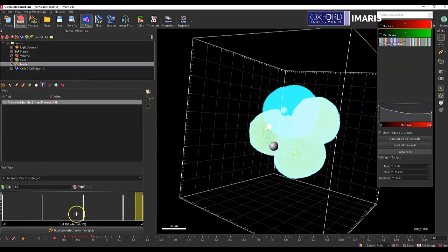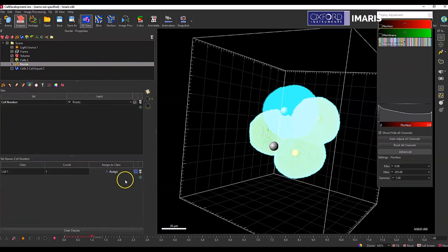And then I'll go back to the filter tab, and you have to have both of these options turned on for the thresholding. And then once again, I'm just going to be selecting the different peaks that are displayed, and then going back to the label, adding a new class, giving it a title that I'm interested in, and then assigning it.